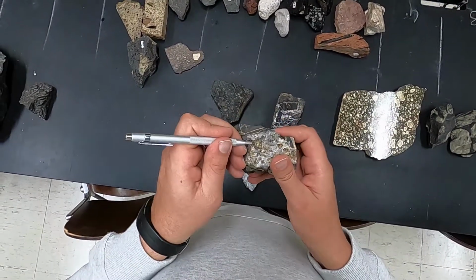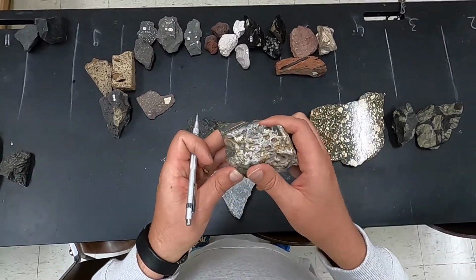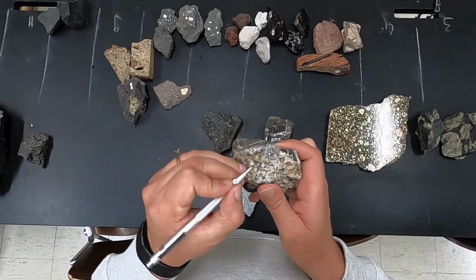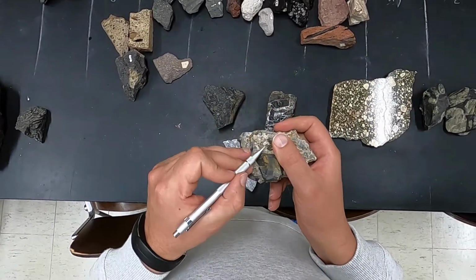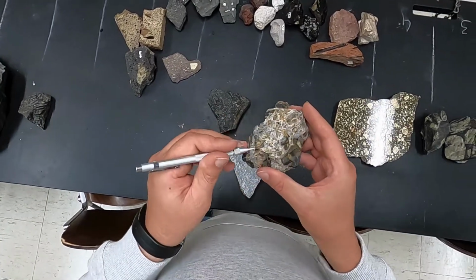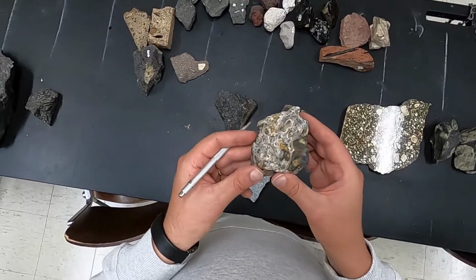I still have some sphalerite, and you can recognize the adamantine luster as well as the variety of colors in these crystals, which tend to be yellowish in places and more reddish in others, which is another indication that this is a sulfide, in particular a zinc sulfide.